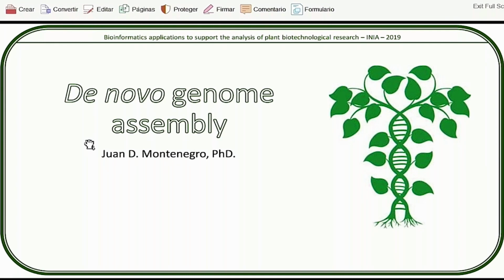No, that's a very good start. So basically, when we talk about de novo genome assembly, we're talking about putting a genome back in order, inferring the original sequence of a whole genome. What is the order?